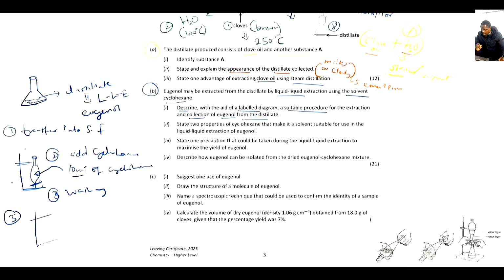You clamp it back again. Now, allow it to rest for some minutes. You clamp and then allow the solution to rest, keep it for a while. Allow the solution to rest a little bit. This helps the solution to separate into two layers.